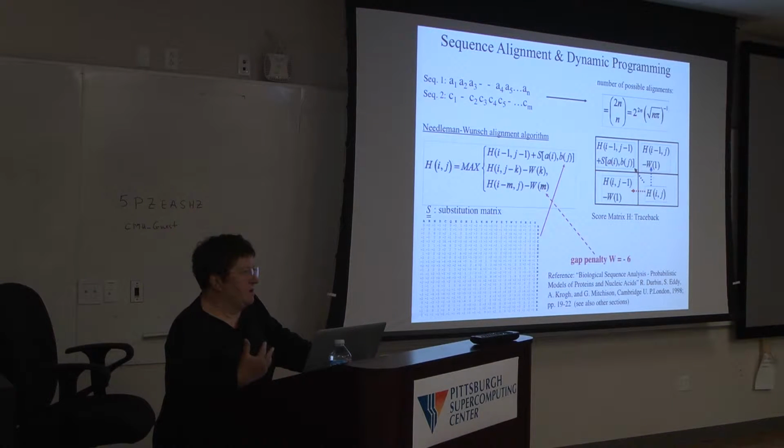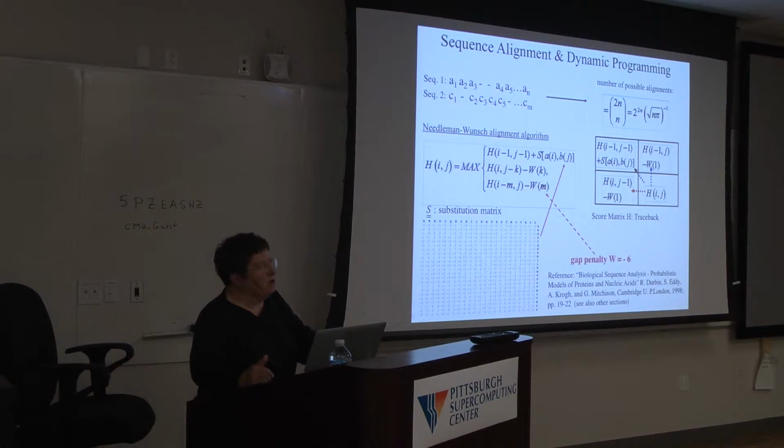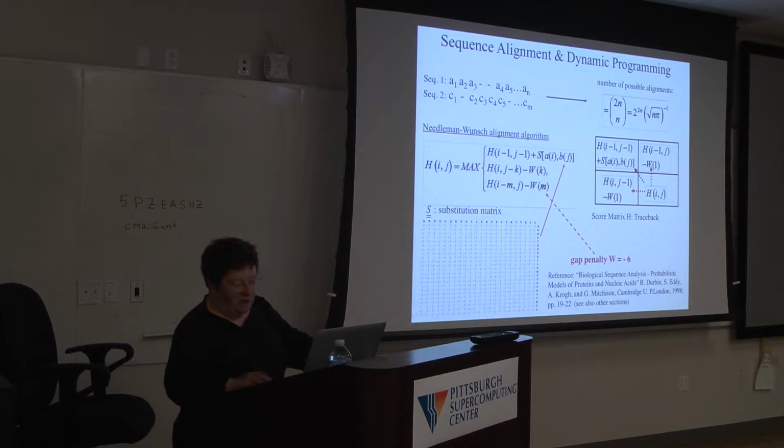And what I would say is MAFFT is one of the better ones. There are other ones called MUSCLE and T-Coffee. They're also very good. You can bring in any alignment and view it in Multi-Seq, but these are the two that we offer: the classic Clustal and MAFFT.